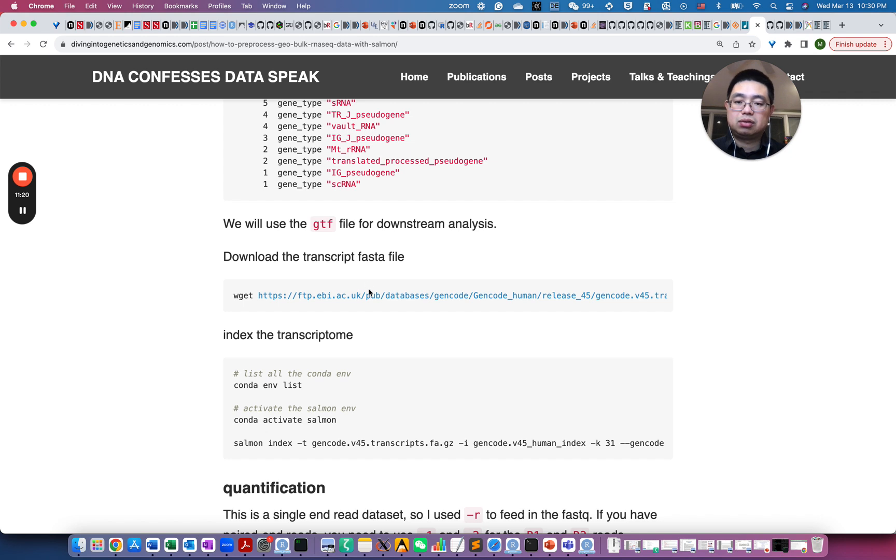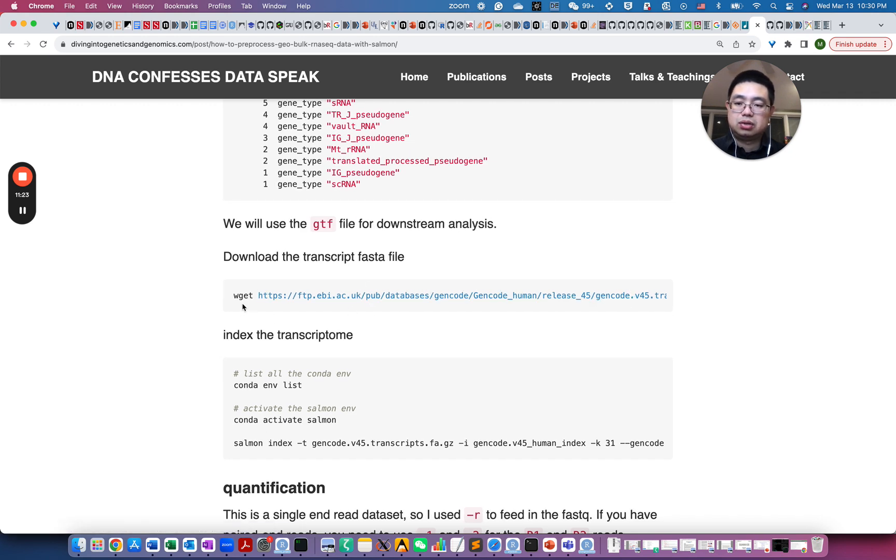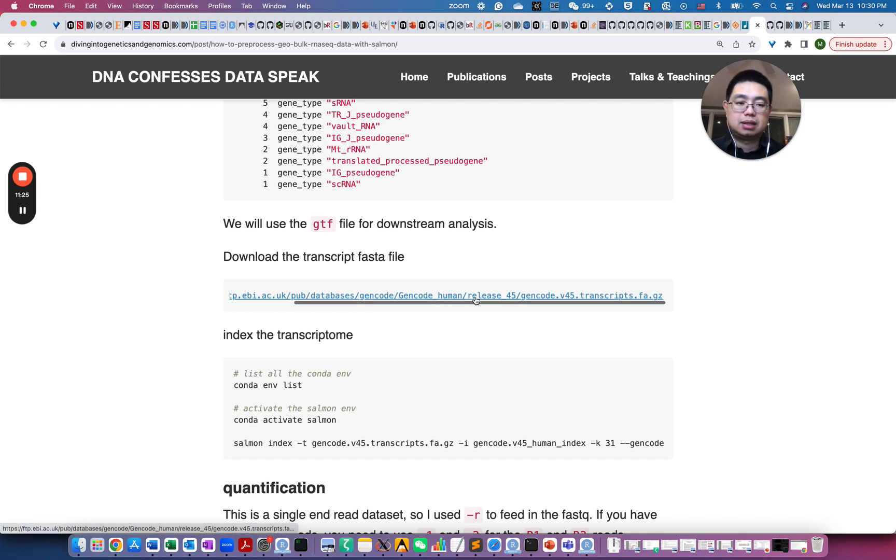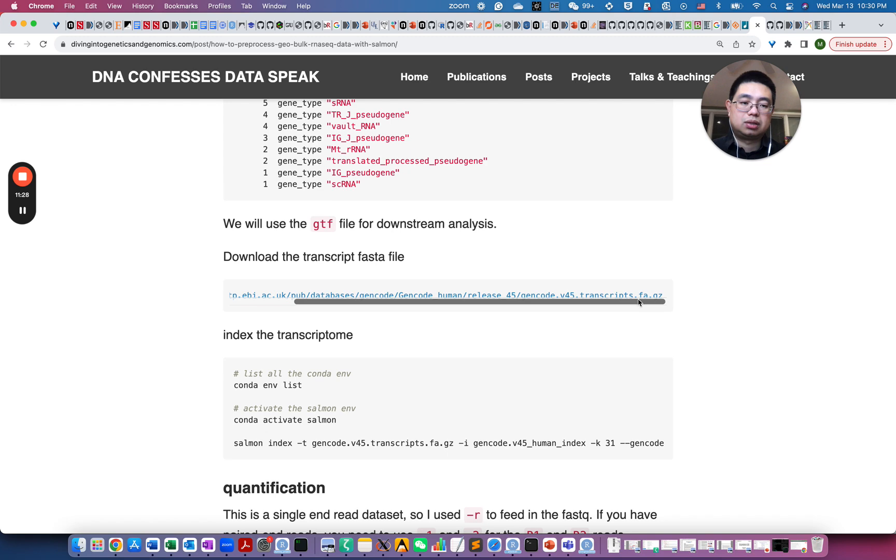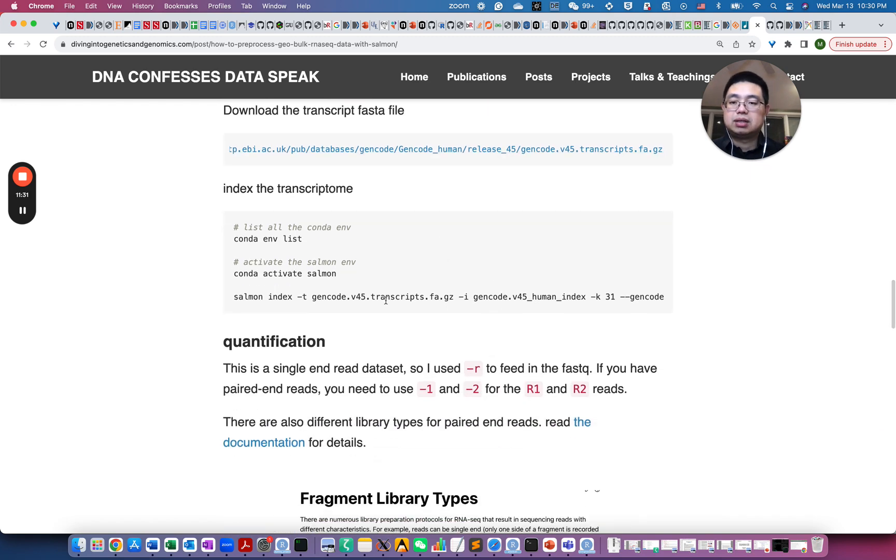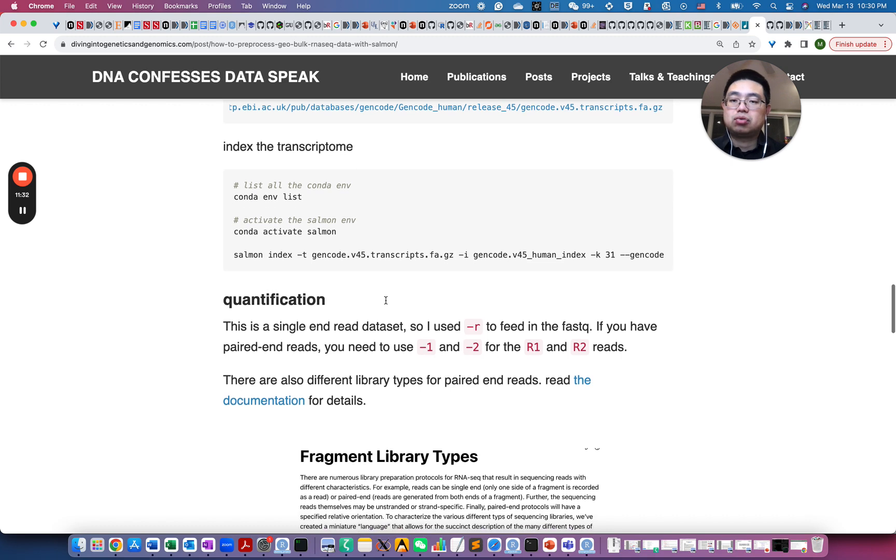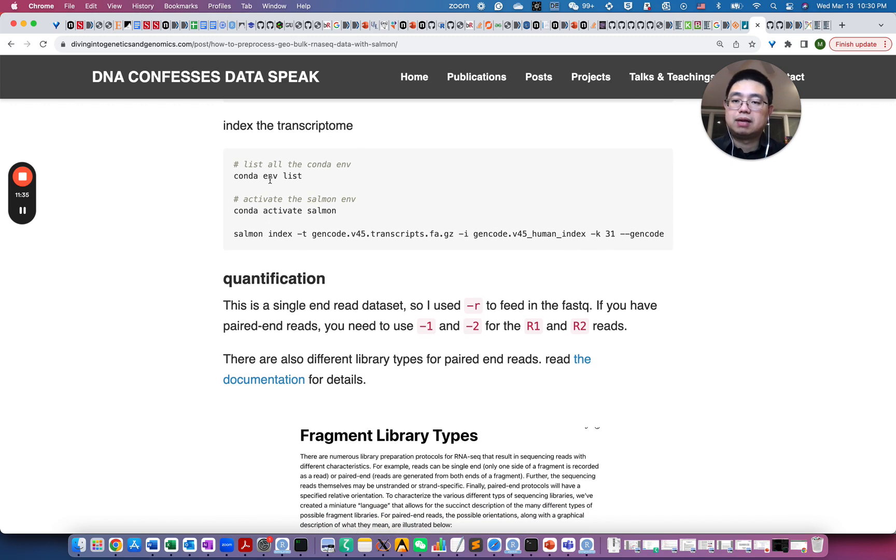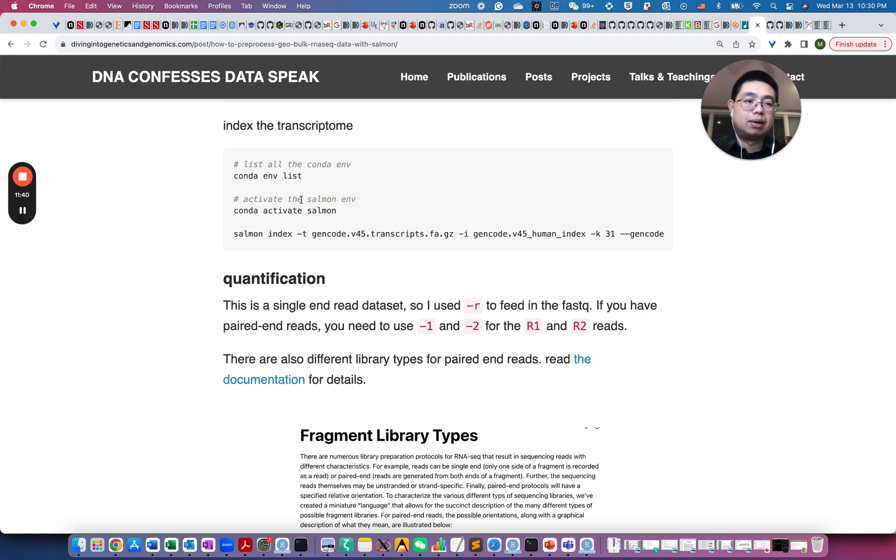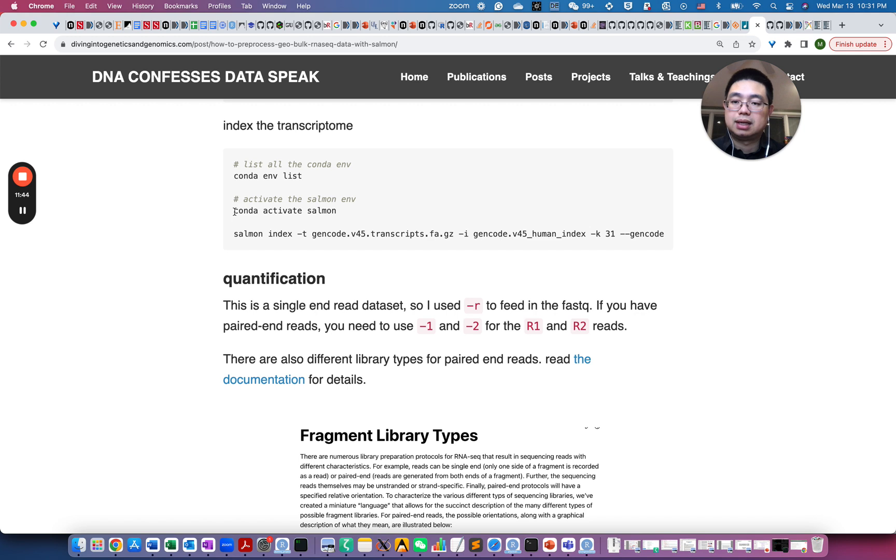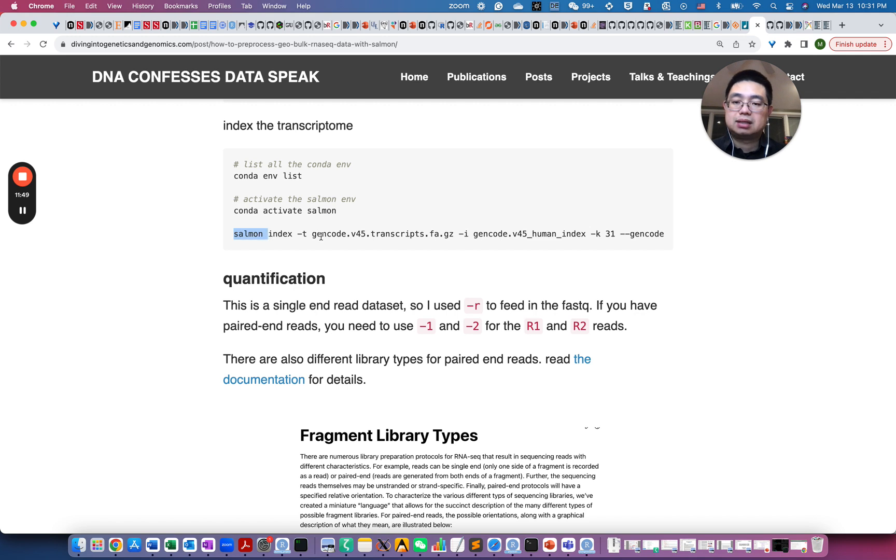Let's actually download the FASTA transcript FASTA file as well. So just wget commands, and then download this Gencode transcript FA.gz file. So now we can index the transcriptome. You can list whatever the environment that you have here. If you don't remember which environment that you created for Salmon, then you conda activate salmon and then you do salmon index.